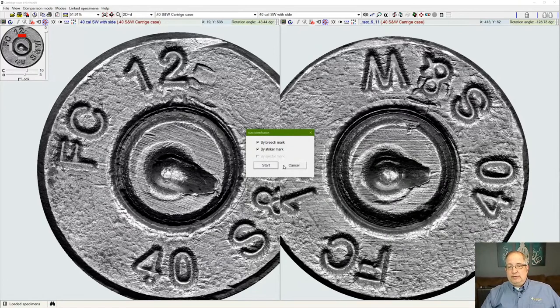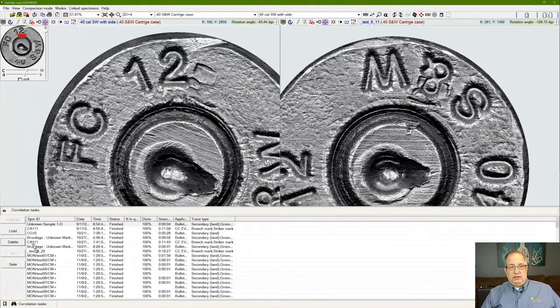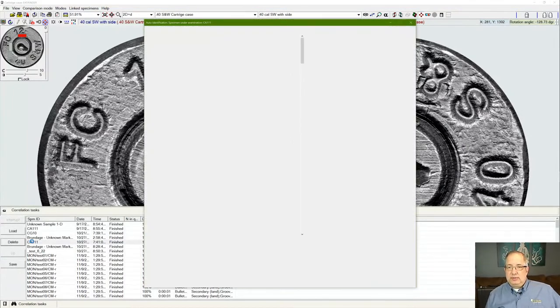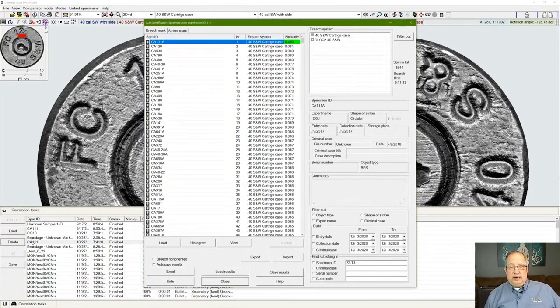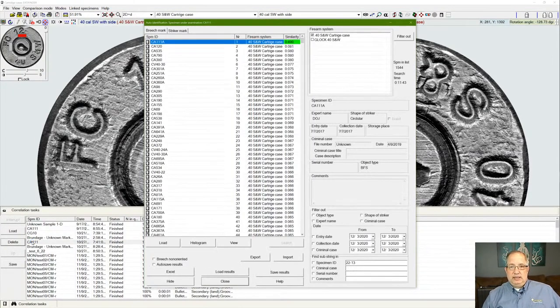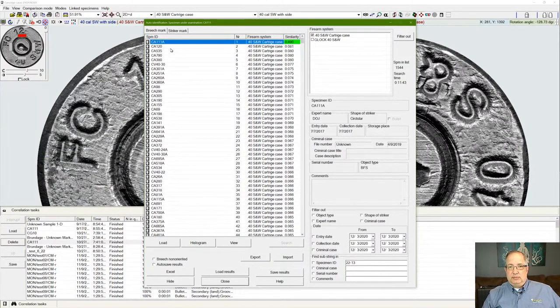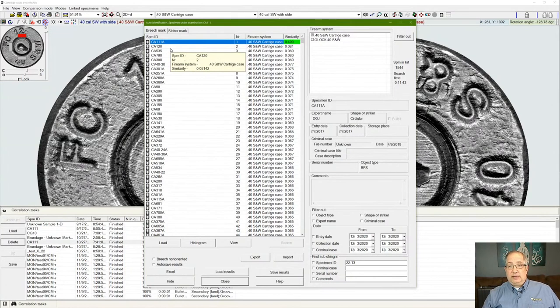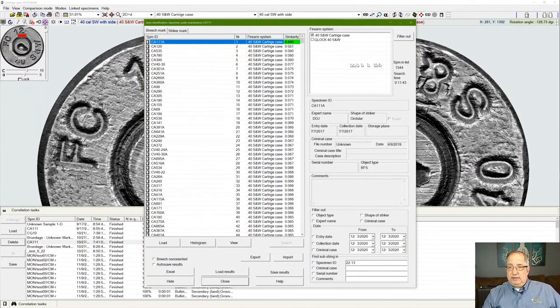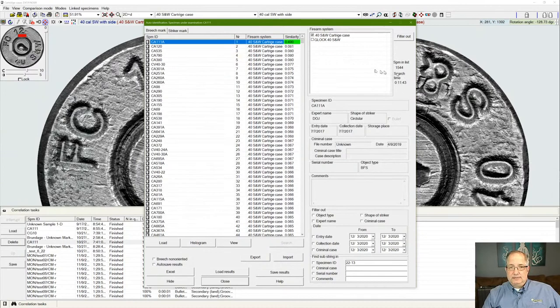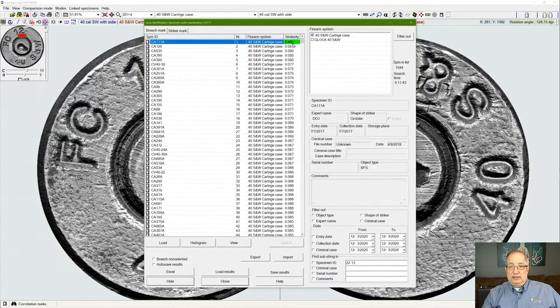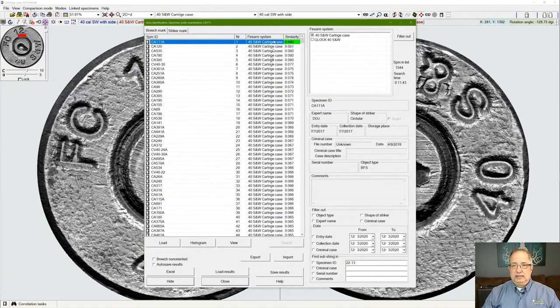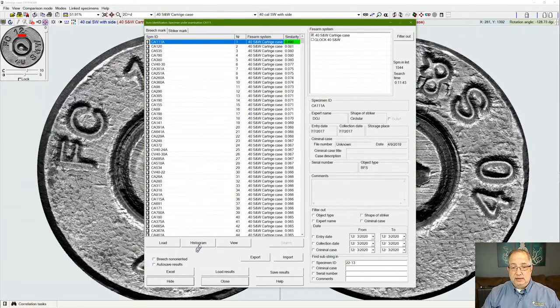When we run one of these searches, the software can run in the background to determine a ranking of all the samples in the defined list and give us an ordered ranking of similarity of all the samples in that test. Now in this case, we're looking at a previously run search of .40 caliber Smith & Wesson cartridge cases where we had over 1,500 samples in the list. We've ranked them by similarity, and we have one outlier statistically that has some difference from all the others in that sample set.